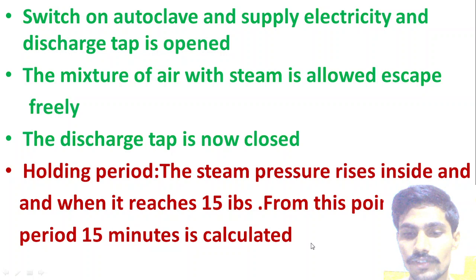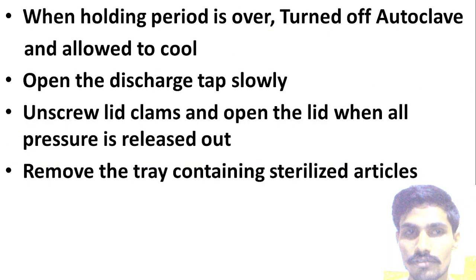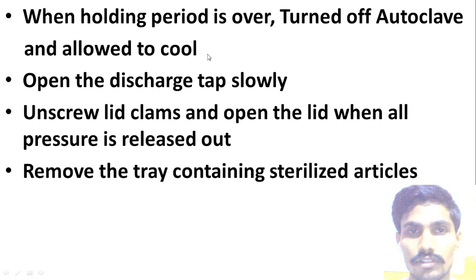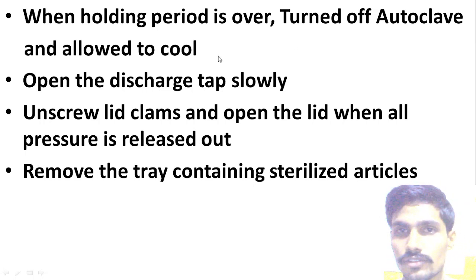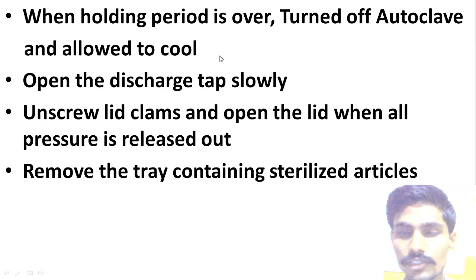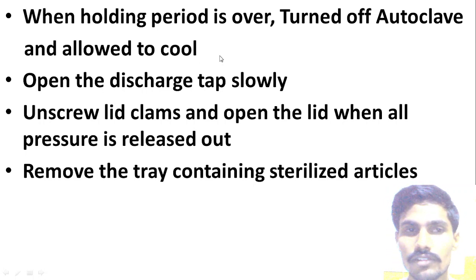After 15 to 20 minutes, what can you do? When the holding period of 15 to 20 minutes is over, turn off the autoclave. Switch off the autoclave and allow it to cool. After you turn off the autoclave, you should not remove the lid immediately because there is pressure. So we have to allow the autoclave to cool down. Next, what can you do?